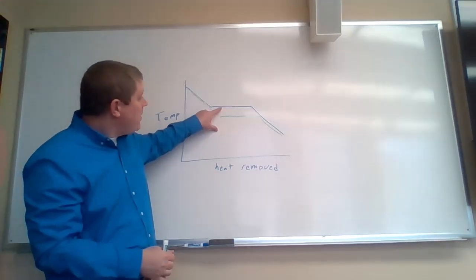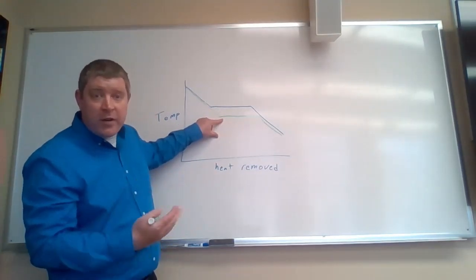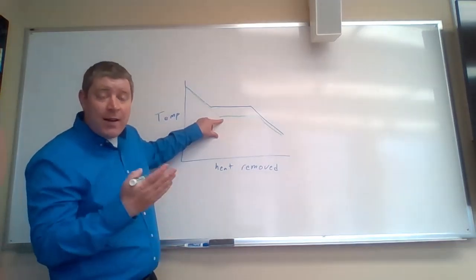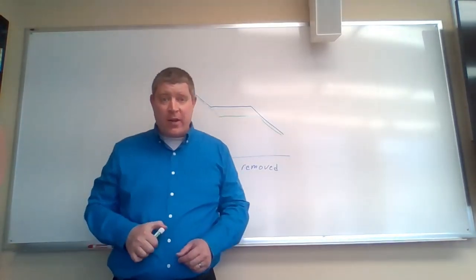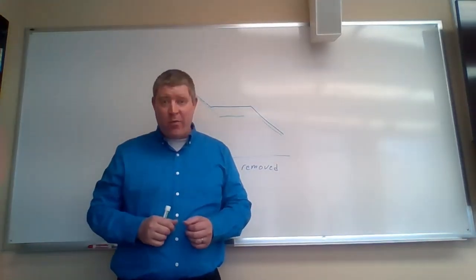And the amount of that freezing point depression will depend upon the solvent that we have, which in this case is going to be lauric acid, and on how much solute is dissolved. It does not depend on the identity of the solute. It only depends on the total amount of solute that we have present.